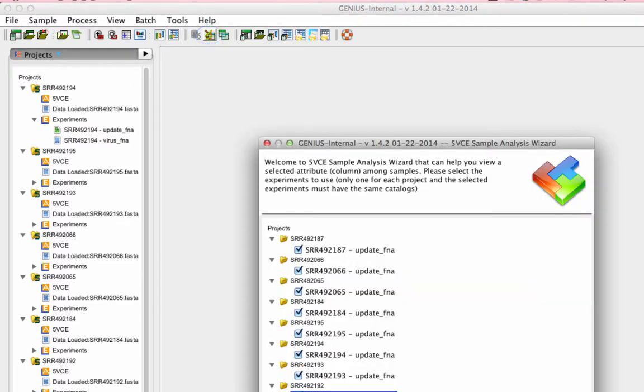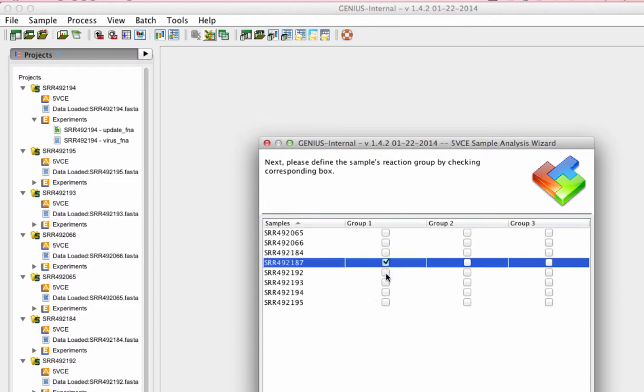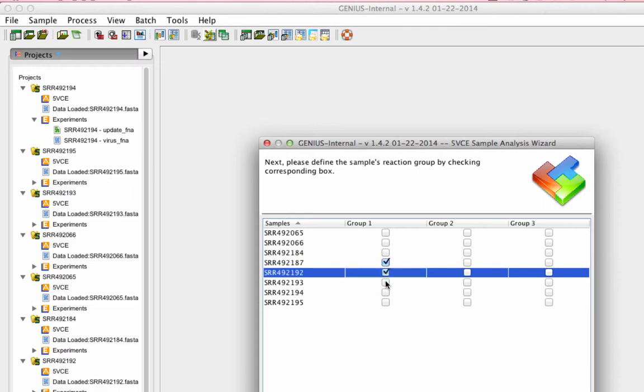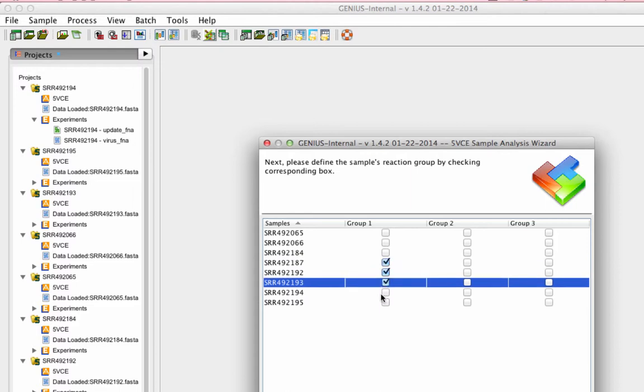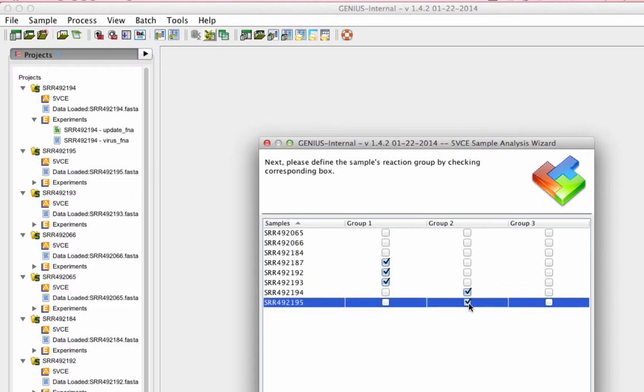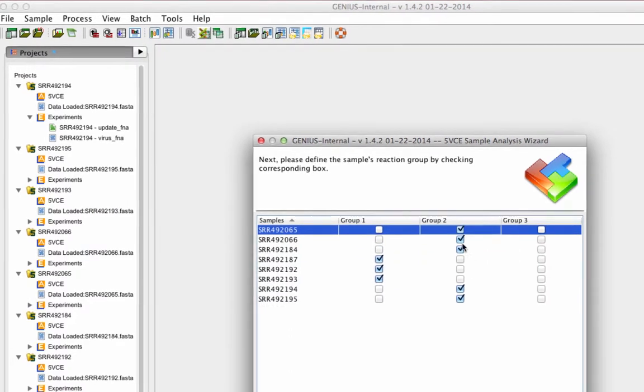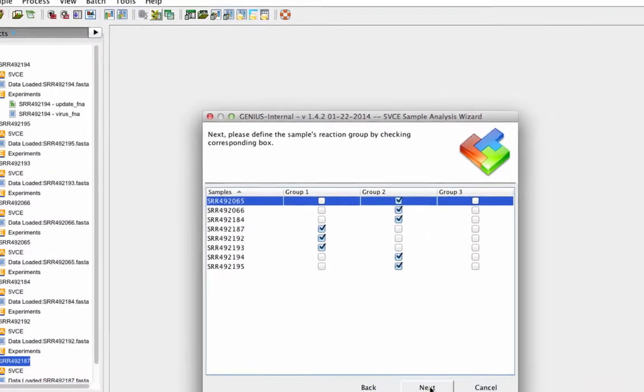We are loading infant gut microbiome samples from the local drive. This dataset was generated from fecal samples collected on postnatal days 15 to 24 from a female infant. We are grouping the samples based on whether they were in early or late days.